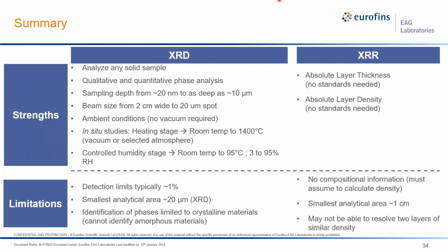So this is my summary slide. The long story short, X-ray diffraction is actually a structurally sensitive technique. It's not actually elementally sensitive like some of the other techniques that were talked about today. And so what we really get to probe is how the material is structured and how the atoms are arranged in a long order. And then your XRR gives you a lot of great thin film information.